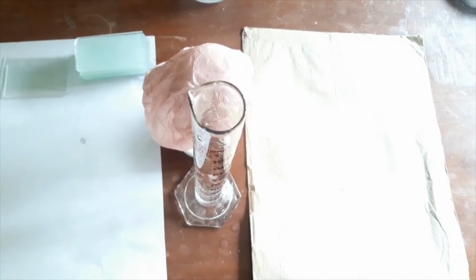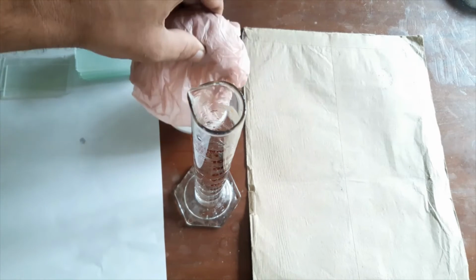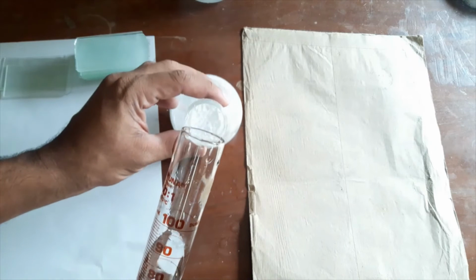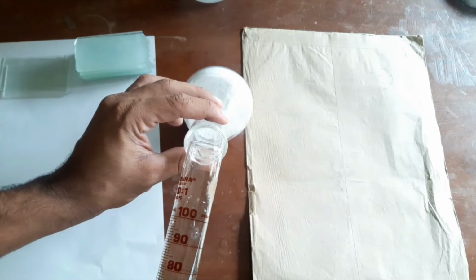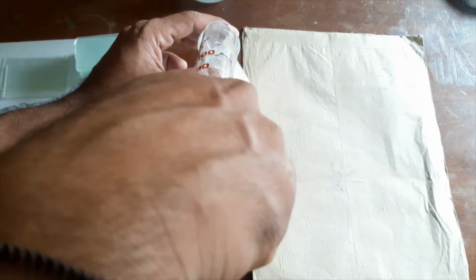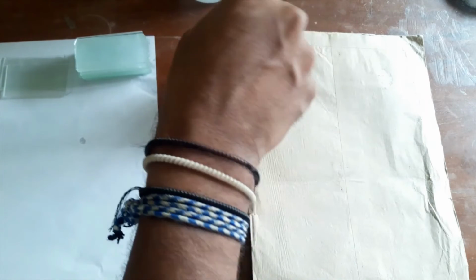Okay, now you can see here our silica is now settled. I will add 80 milliliters of water onto the silica powder mixture very slowly along the wall of the conical flask. I added double the amount of water than its weight. Now I will use the spatula and I will mix it.